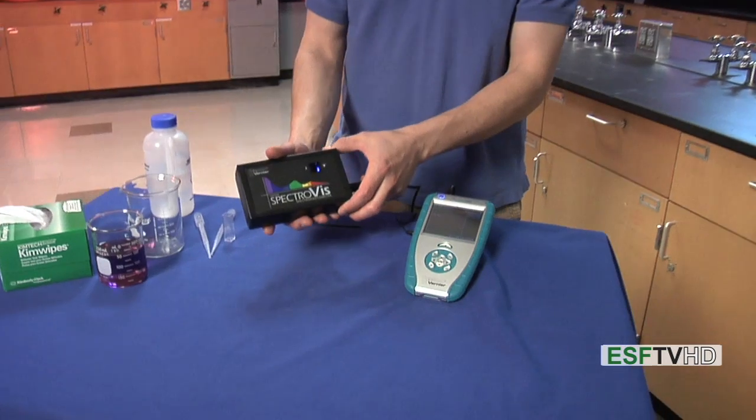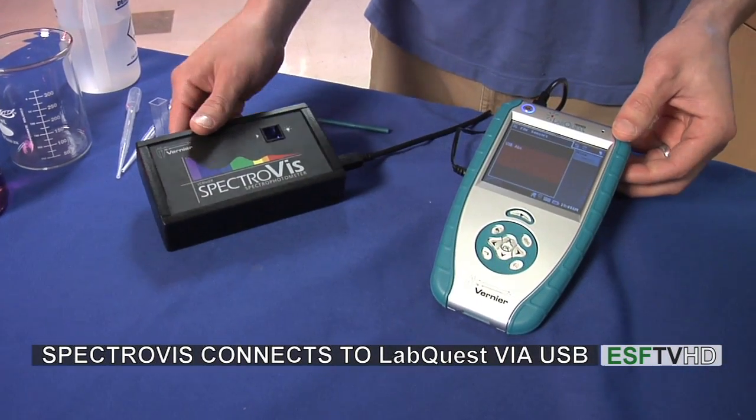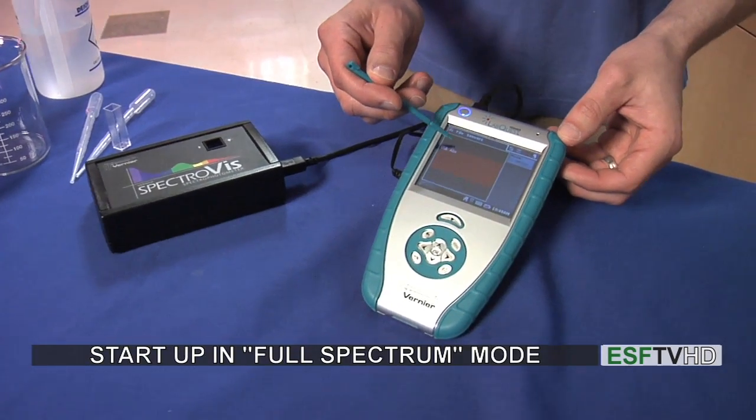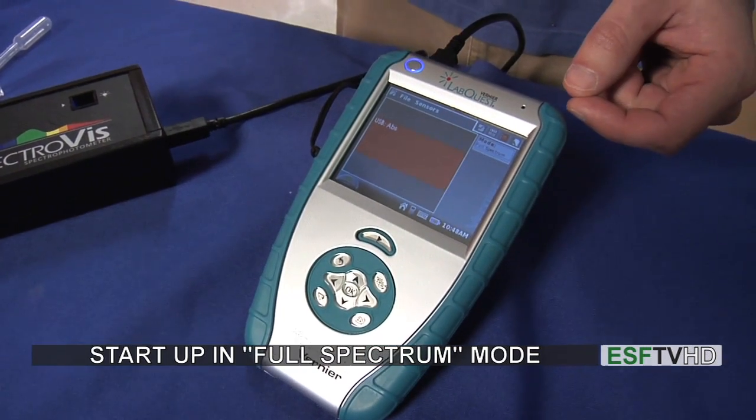Welcome back to the lab. In this segment, we're going to talk about using the Vernier spectrometer with the Vernier LabQuest. The setup is as follows: we have the SpectroViz spectrometer plugged in via a USB port into the LabQuest. Once we turn on the LabQuest, we see that it tells us we're going to be reading absorbance values in full spectrum mode, and that's the correct starting point.